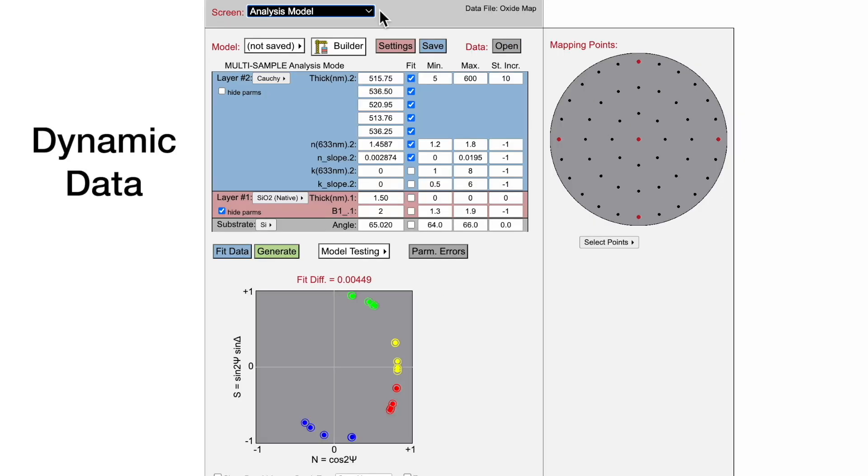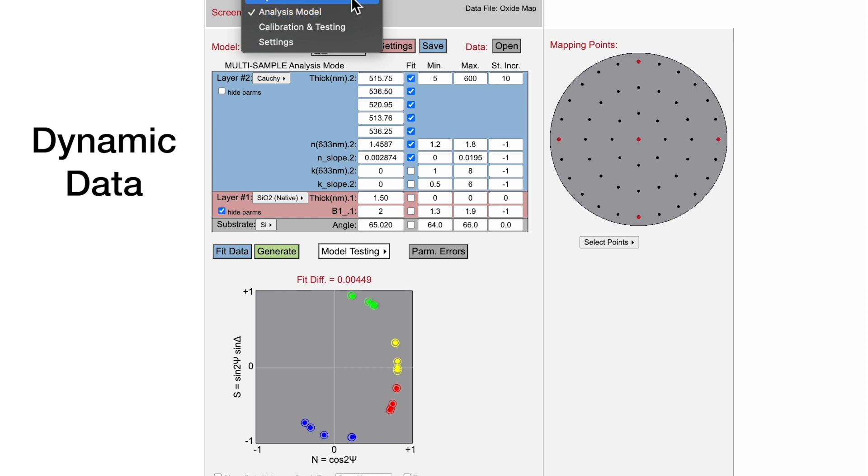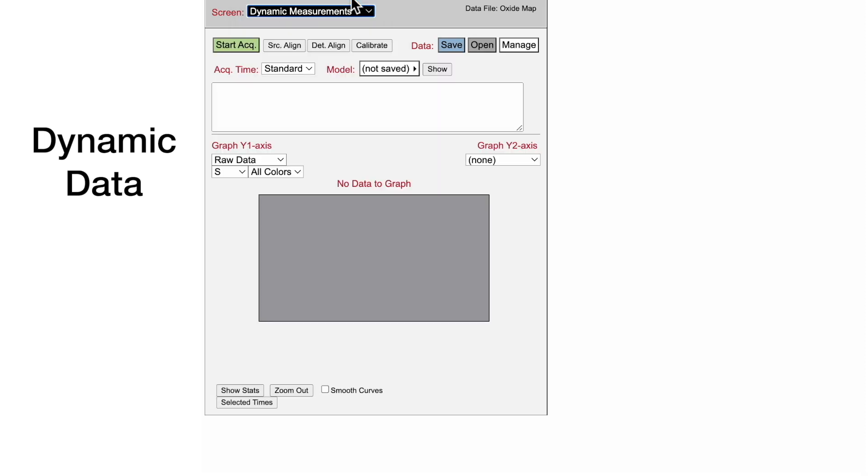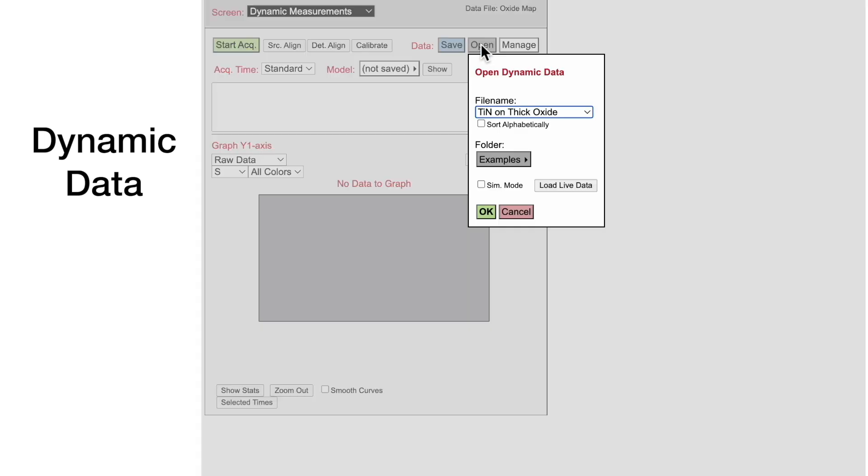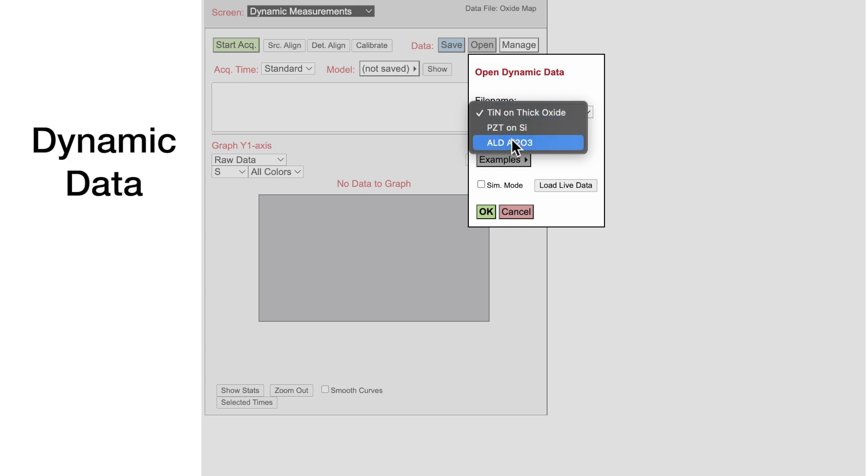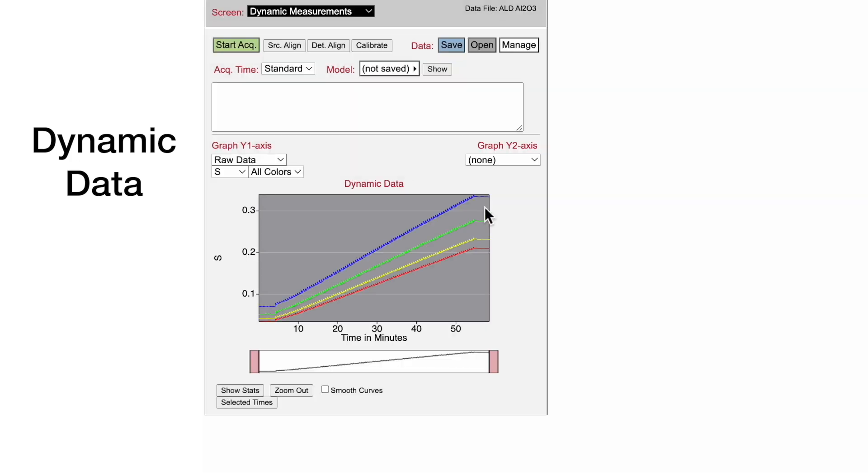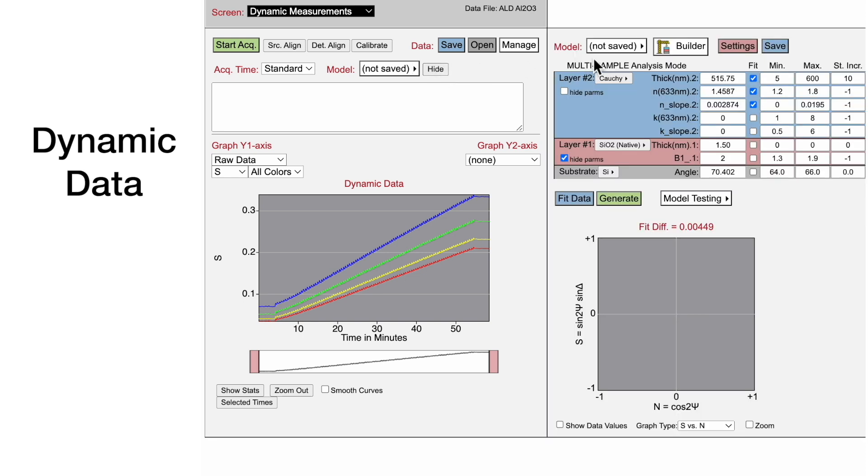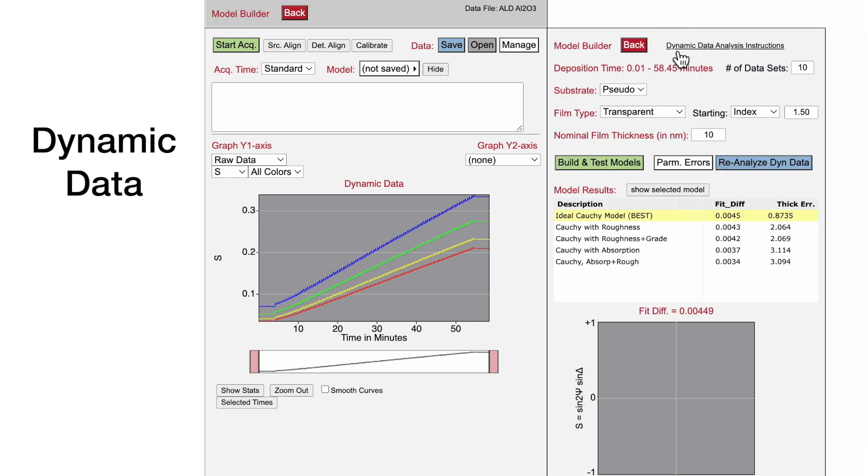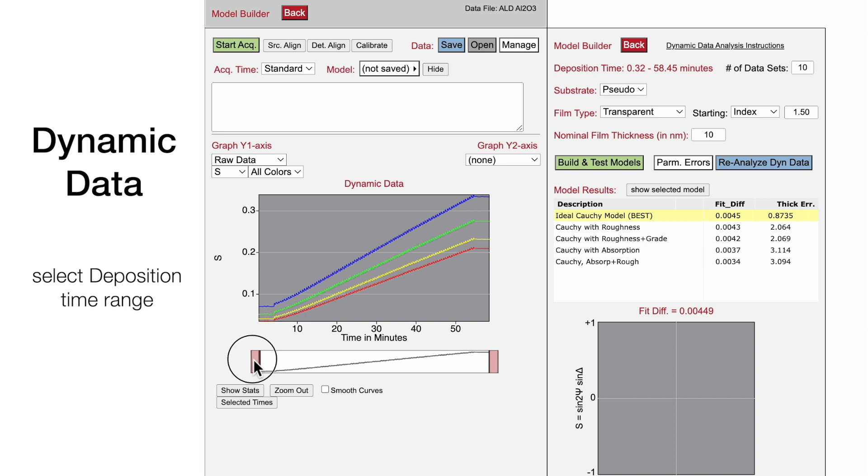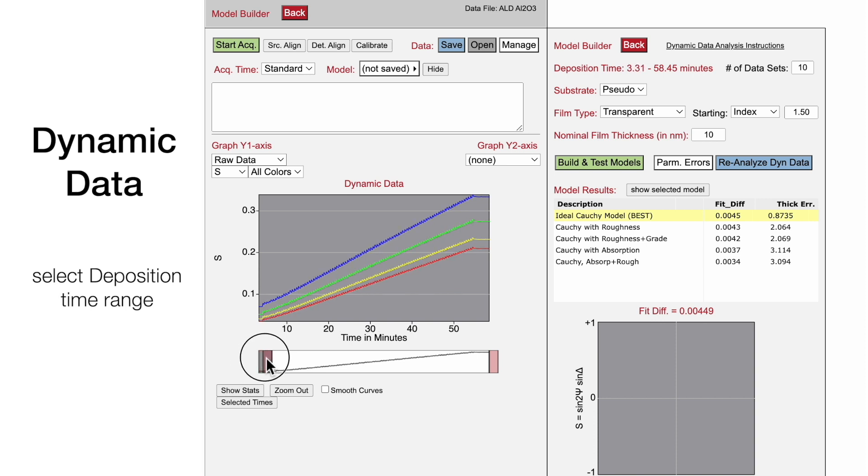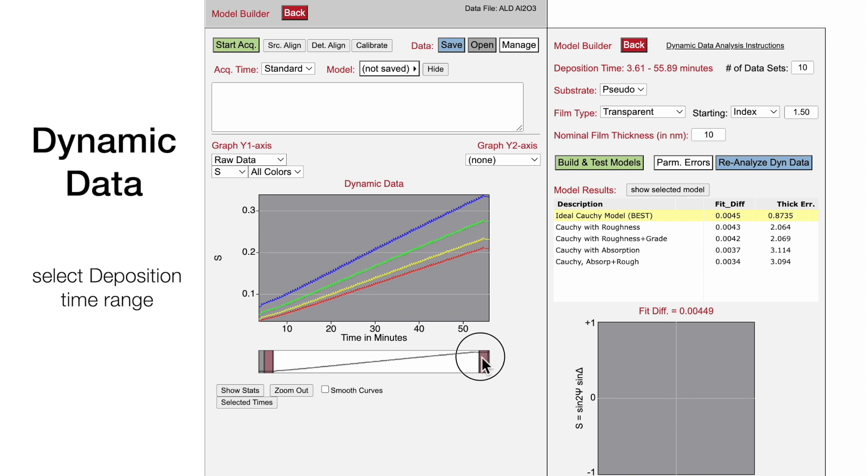Model Builder can also be used to analyze dynamic in-situ data that is acquired versus time. For this example, we will use an aluminum oxide film that was deposited by ALD. We start by showing the model and displaying the Model Builder screen. Then use the zoom bar to select the dynamic data range from just before the deposition was started to just after the deposition ends.